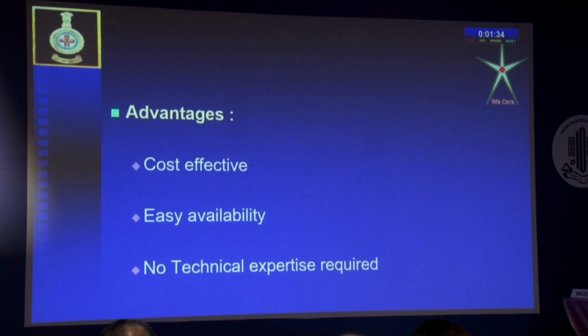So coming to the advantages of this technique, it is very cost effective. There is hardly any cost involved. The cover slip is easily available in any lab, and there is no technical expertise required in this.